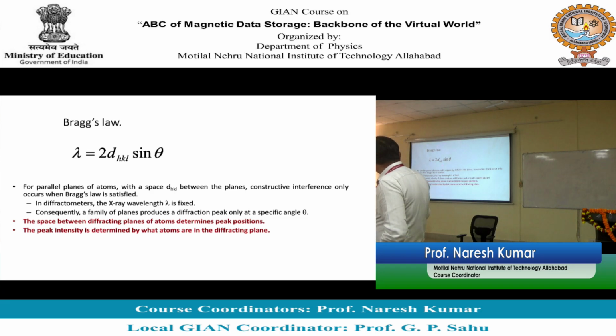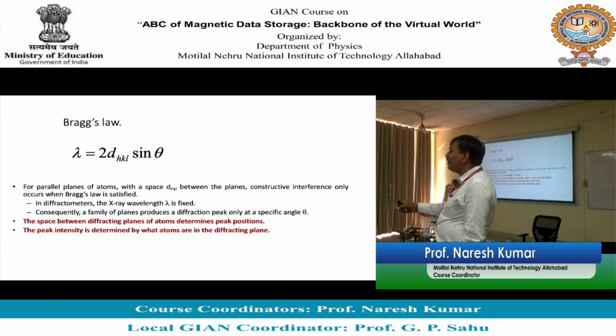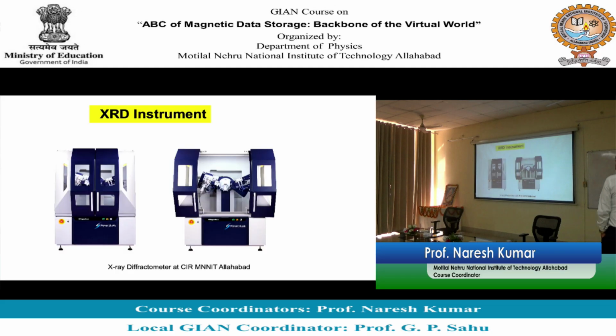लेकिन वो d किस प्लेन के हैं कैसे पता चलेगा? Unless you know that these peaks are from this plane, तो मेरे लिए बेकार है. ठीक है सर? Now my next job is to find out the address of these planes, है ना? hkl. How to get hkl? ये थोड़ा सा ट्रिकी है, 10 मिनट और मैं बात करूंगा. ये मैंने बता दिया है.